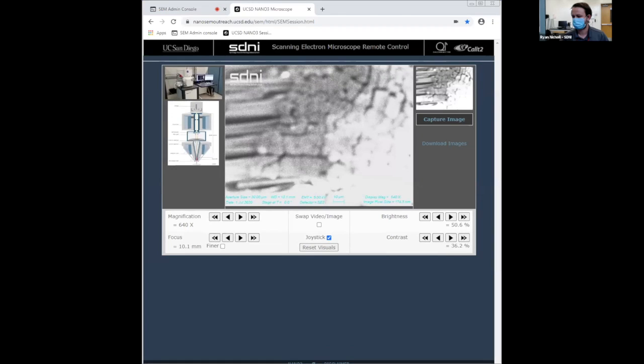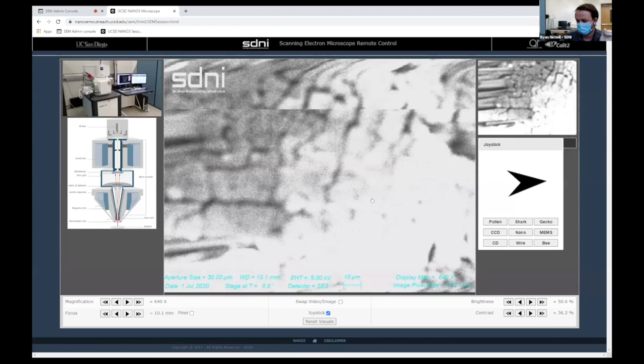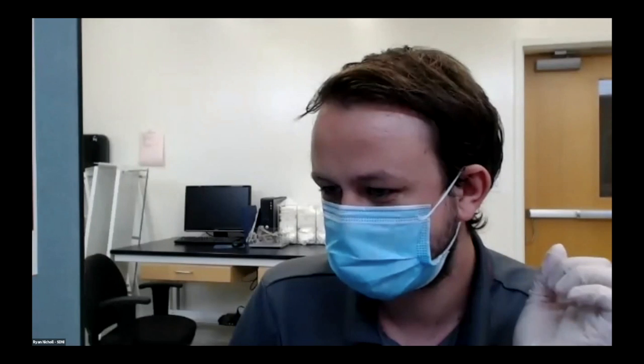Dustin, can you go on the top screen and see view options, and you could also request remote control. I see. All right. I think I just stop remote control. I've stopped it now. Okay, perfect. I'll see if I can. I haven't pushed any buttons. I don't want to sabotage what you're doing. No, push a button. Okay. So I just pushed a button and now I've just lost something. Okay, great.